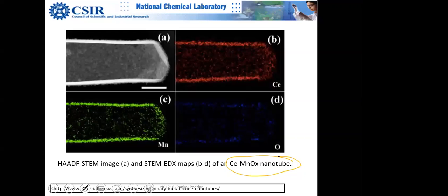But here you can pinpoint where manganese is and where oxygen is. This is basically elemental mapping. As I was telling you, you can get localized information. This technique is basically scanning transmission electron microscopy. So how do you do that? Normally, let me use the whiteboard.